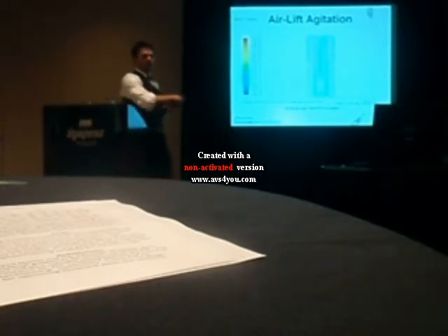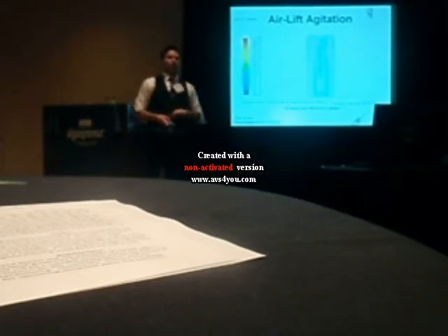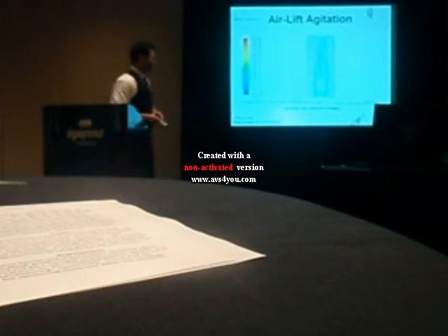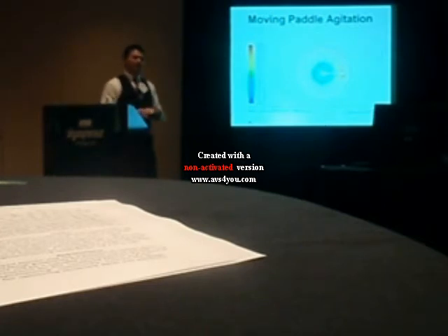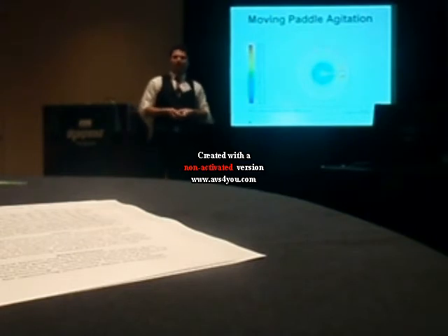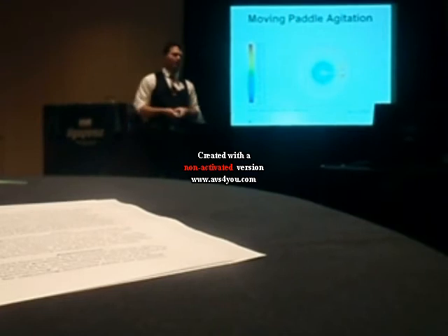Agitation means the flow of fluid in your container. Aeration means the availability of CO2 to your algae strain. We also modeled a moving paddle using a different type of fluid analysis. As you can see, there's a higher velocity vector around this moving paddle right there, so it's not as good a design as that airlift technique. And this is also just a brief synopsis of some of the alternatives. If you want to get more technical and get actual numbers, I'm just presenting ideas, so you can ask me after the presentation.